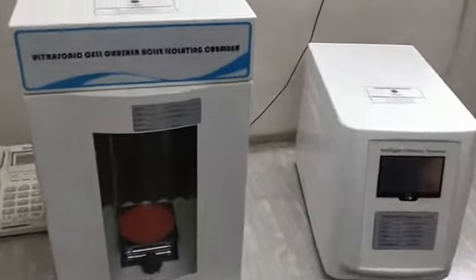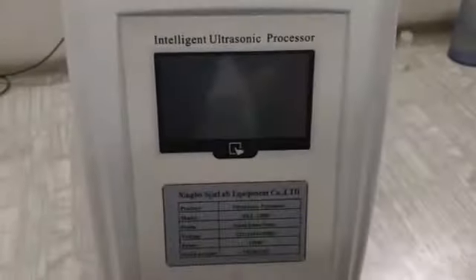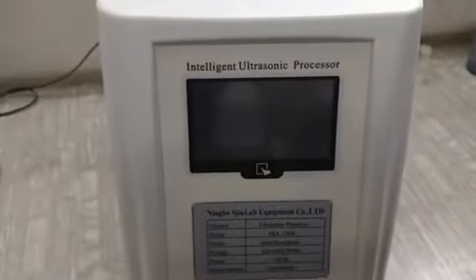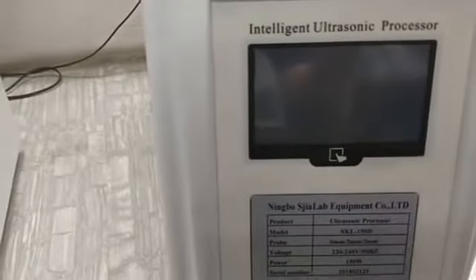Dear customer, we thank you for purchasing the ultrasonic homogenizer or ultrasonic processor. This ultrasonic processor is from Ningbo SJIA Lab Equipment Company Limited, China.